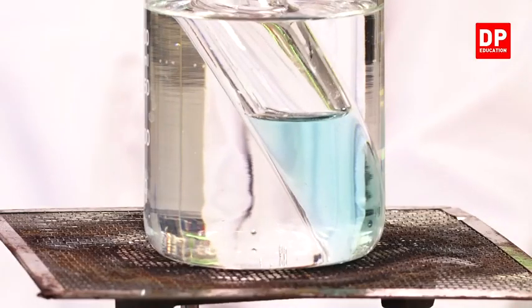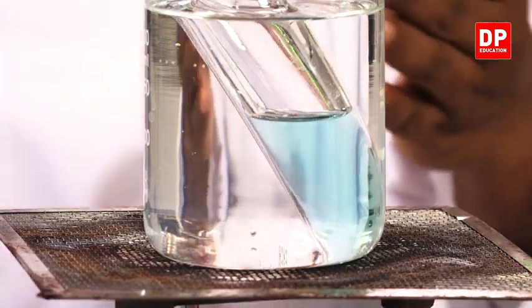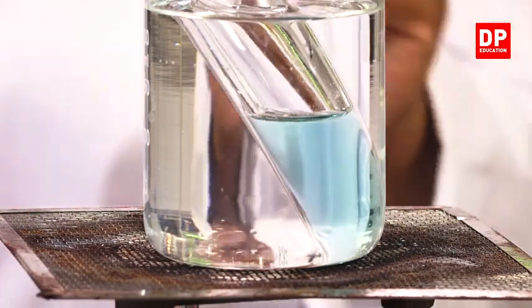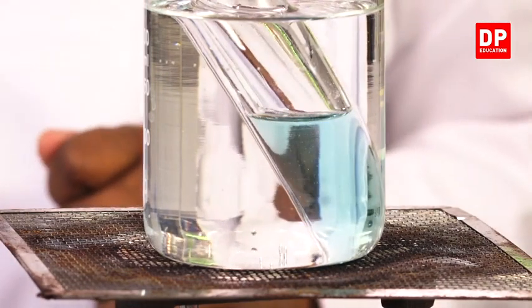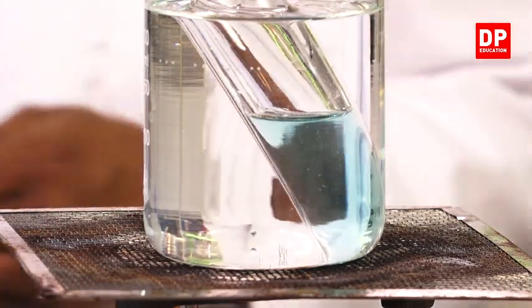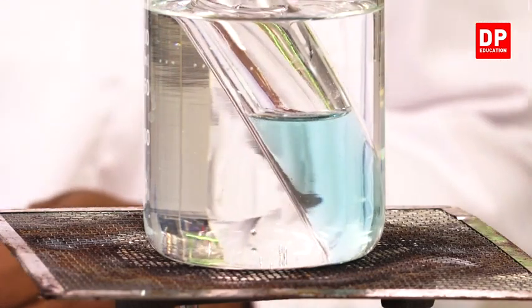Students, you can recollect the color change that has to be observed here. As you can see, there is no change taking place. Still, you can see the blue color of the Benedict solution only.